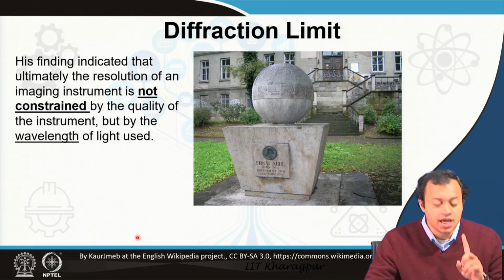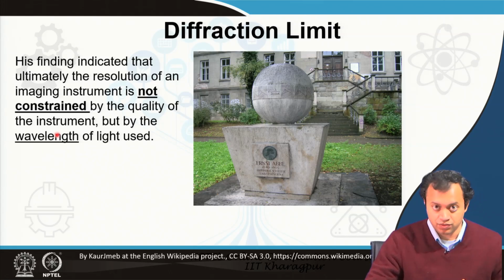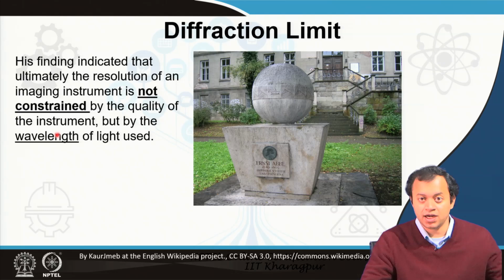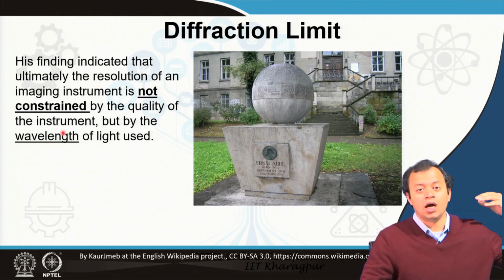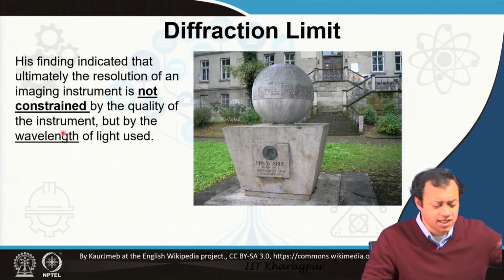So, it depends not on the imaging instrument, but on the wavelength of light used. Remember this, there is a fundamental physical limit. Just like you cannot go faster than the speed of light, several different types of limits are there.